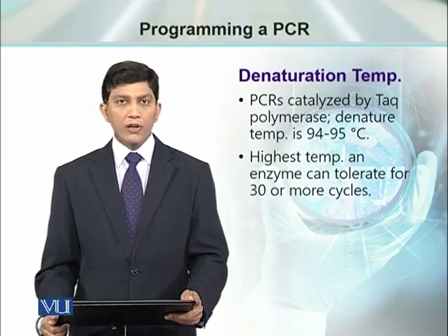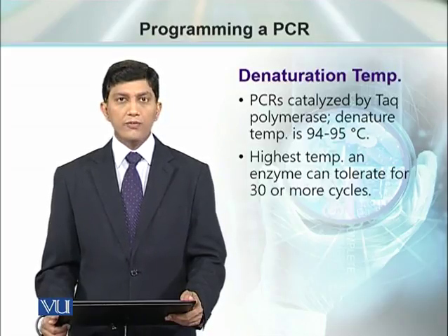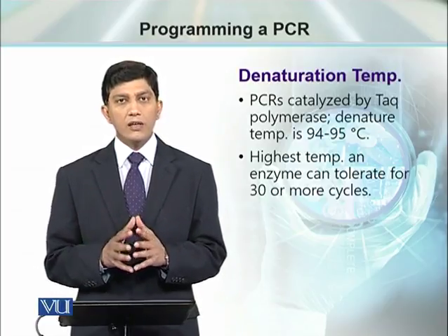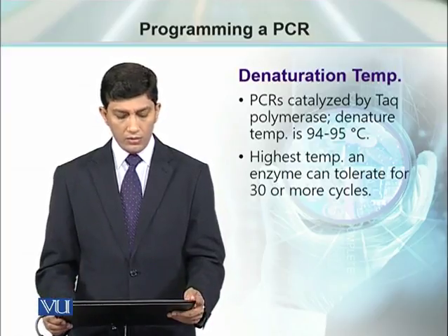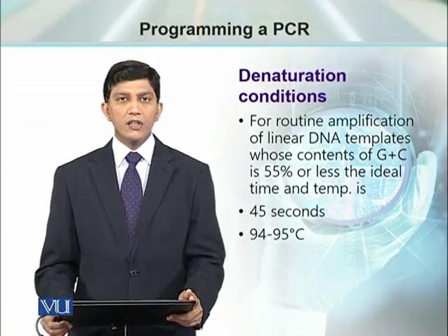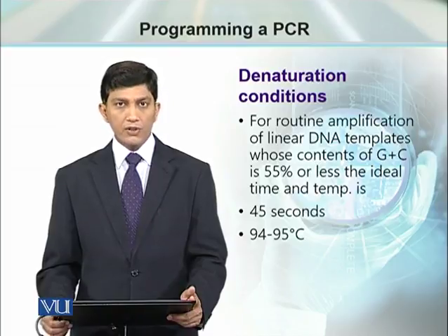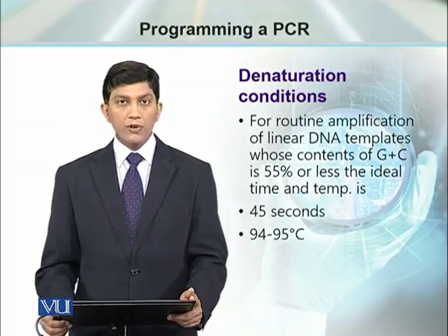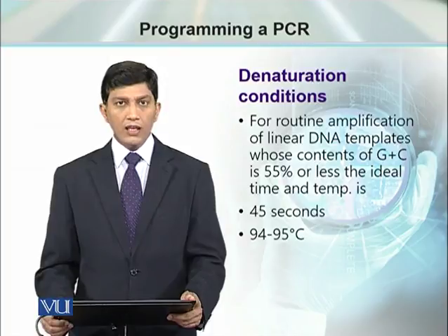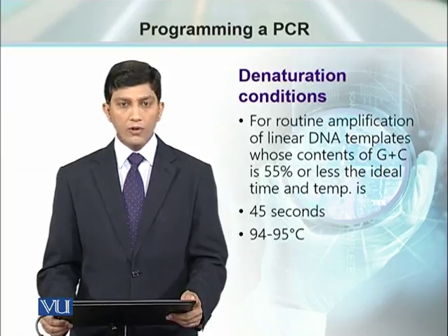While working with the Taq polymerase, the denaturation temperature which is used is 94 to 95 degrees centigrade. Taq polymerase is the only enzyme which can withstand such a high temperature for 30 cycles or more of PCR. For a standard PCR reaction, with a DNA sample having GC content of 55% or less, the time for denaturation should be 45 seconds at 94 to 95 degrees centigrade. If the GC content is more, then we need more time for denaturation.